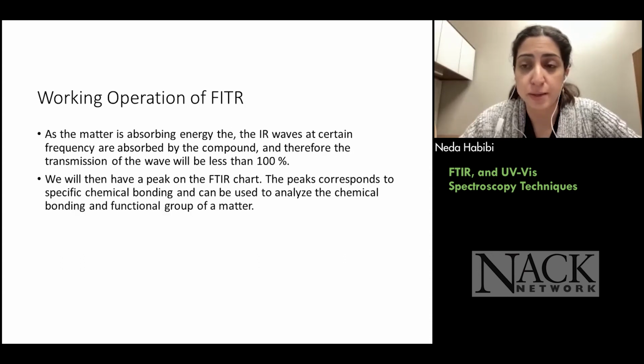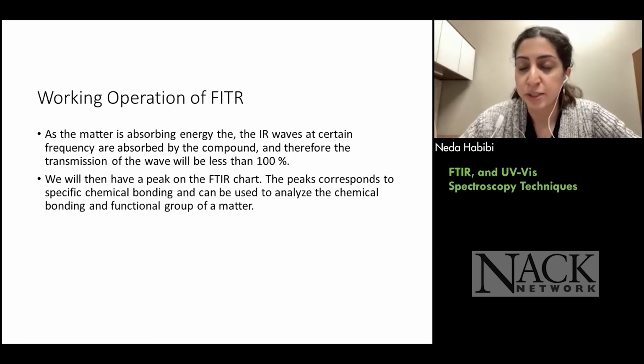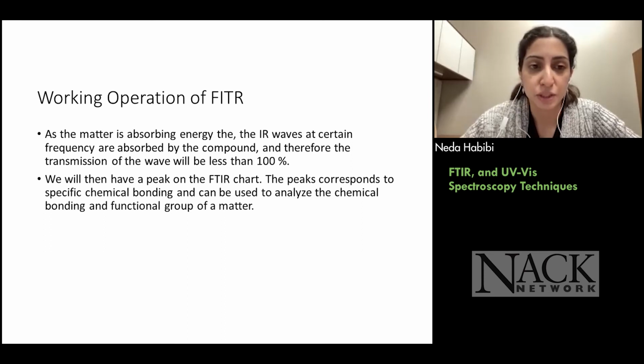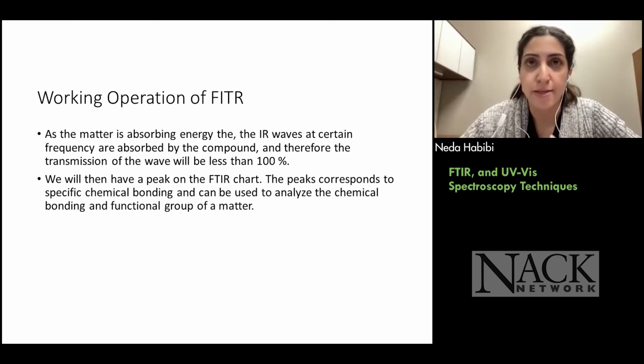As the matter is absorbing energy at certain frequencies, the transmittance of the wavelength will be less than 100%, and that is where we have a peak in certain positions. Those peaks on the FTIR chart can be corresponded to specific bondings and functional groups, and are therefore used to analyze the chemical bondings of a material.